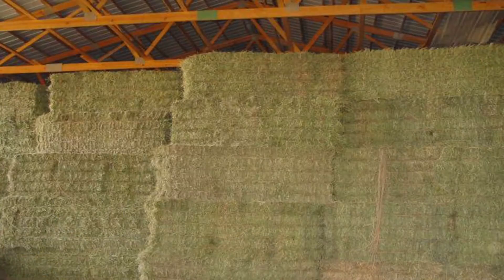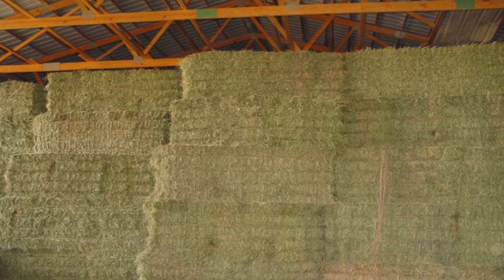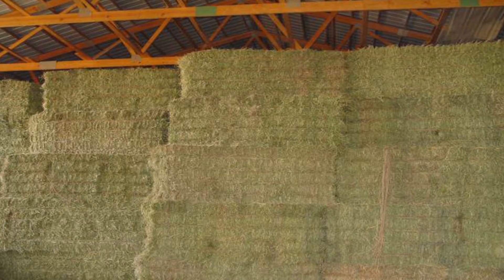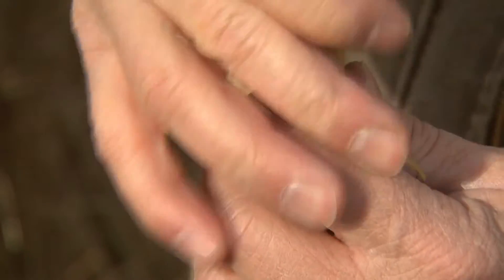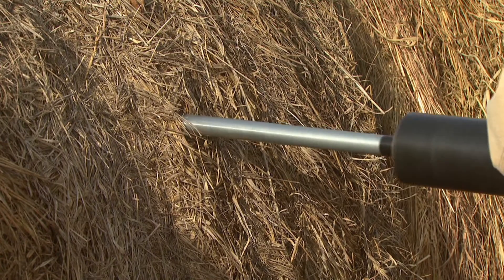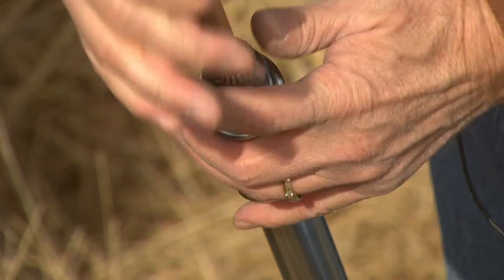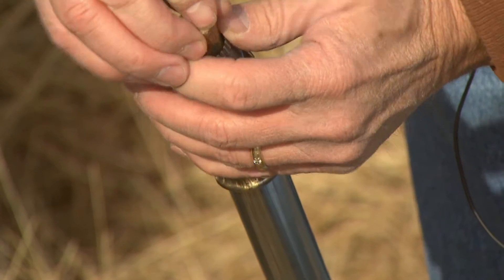For large square bales, the same process can be used. Take a core sample by placing the probe at about the midpoint on the end of the bale, not the side. After each core, plunge the sample into the collection canister. If the forage is more moist than what is common for bale forages, the sample can be wedged in the barrel of the probe. If the probe is not plunged after each core, the forage could become bound in the barrel.